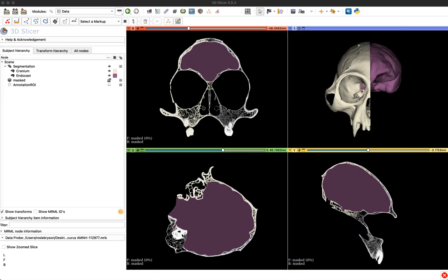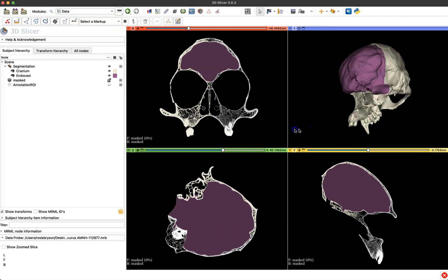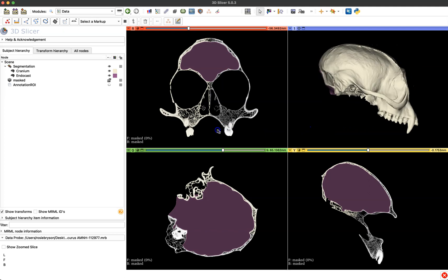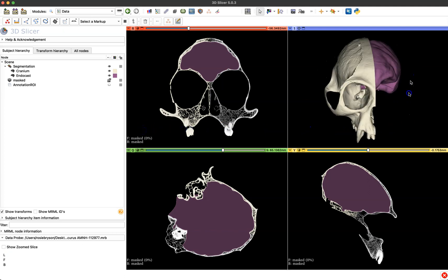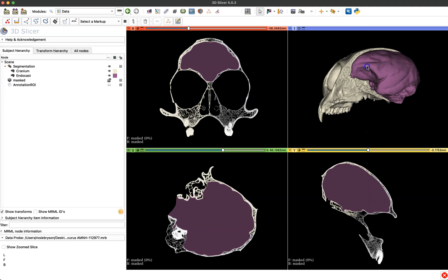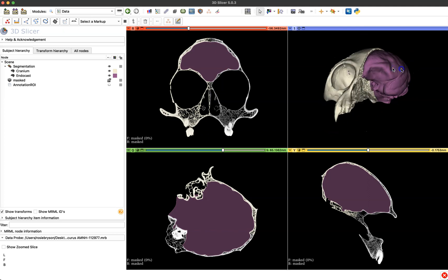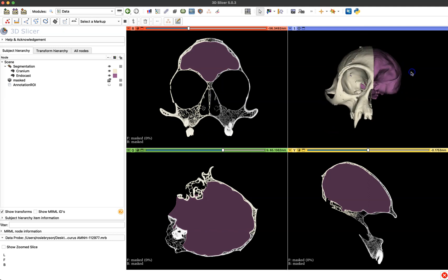So we're going to start out in the main 3D slicer workspace and you can see here I'm in the data module and in my 3D viewer I've already segmented two models that are ready to print. I have half of a primate skull here and an endocast of the brain space. So I've segmented these separately so that we can interact with these models, print them separately and the endocast can be removed from that skull for demonstration.